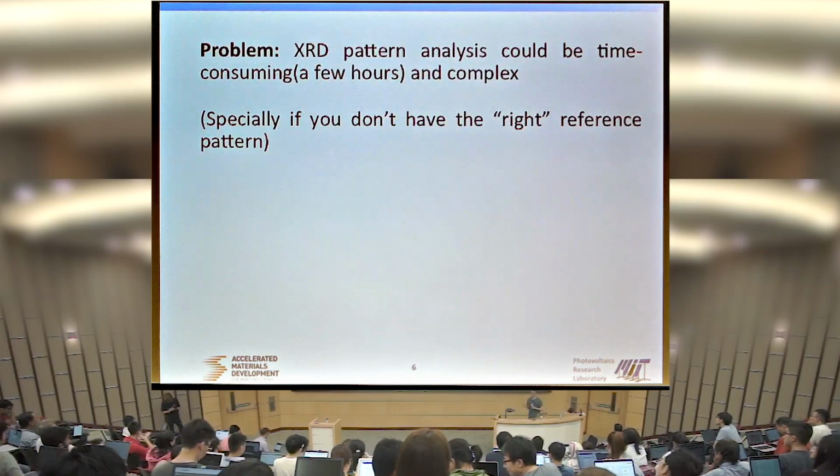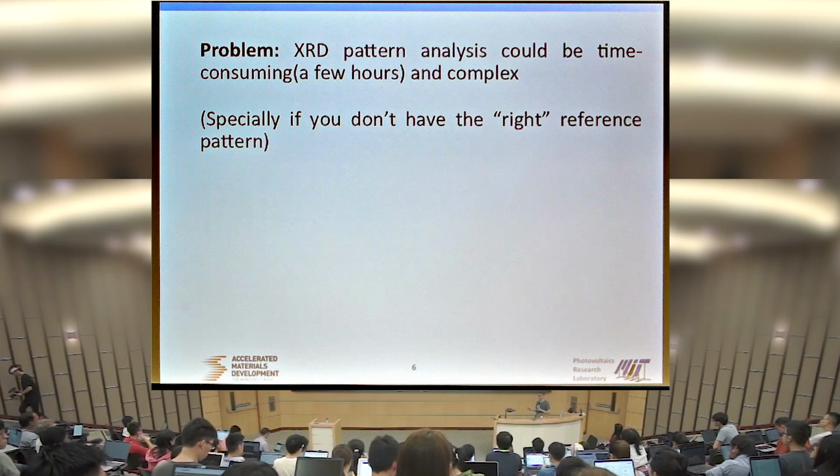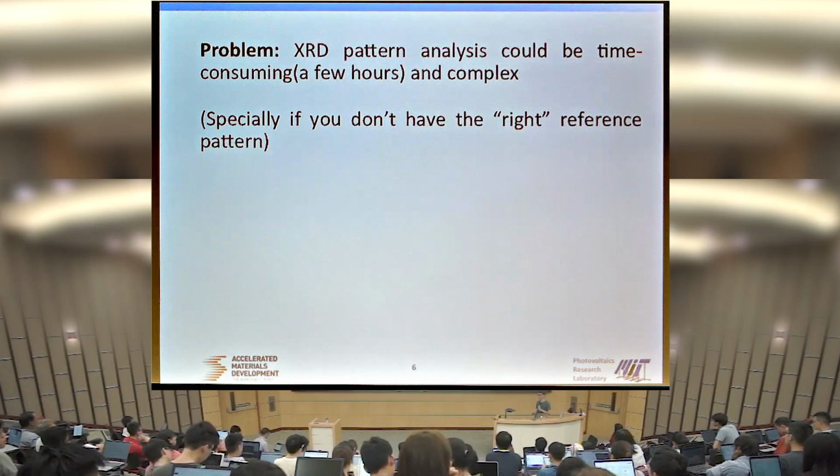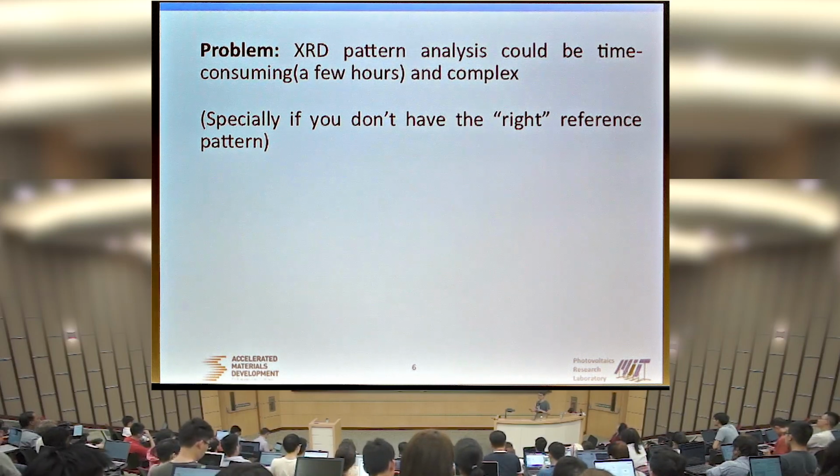This can be time-consuming because it's all done manually, and if you have many compounds, you have to do this repetitively. Especially if you are trying to discover novel materials, where you don't have the reference pattern in your database, it could take hours to do one XRD spectral analysis.